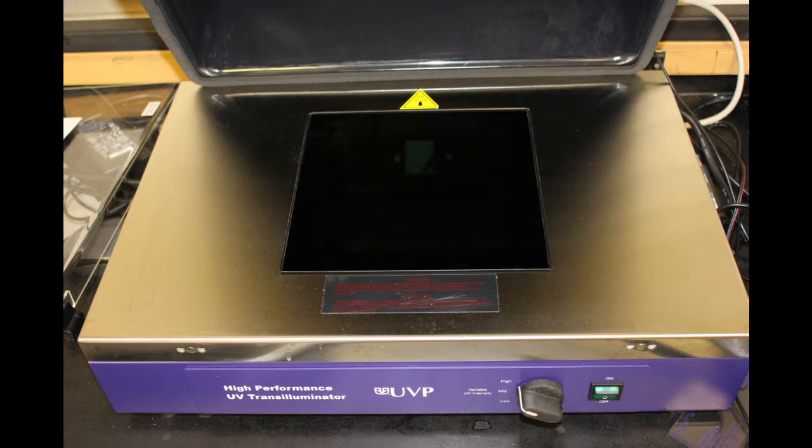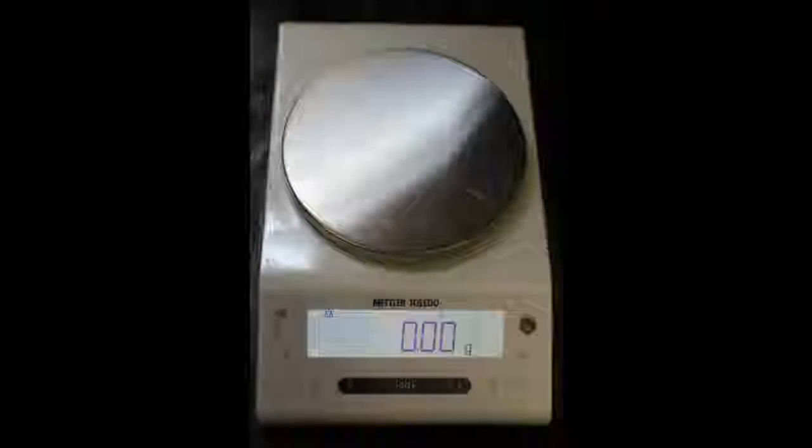Today, you'll learn how to create an agarose gel, load it with DNA, and run it. Different concentrations of agarose in a gel will affect the speed at which substances will traverse the gel. For this video, we'll be making a 1% gel.